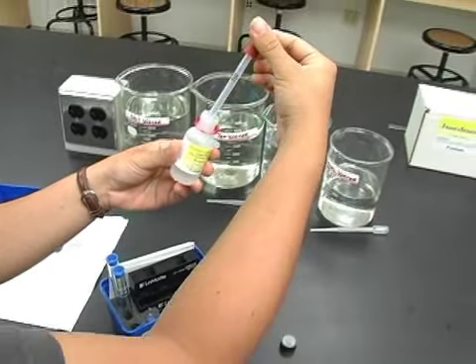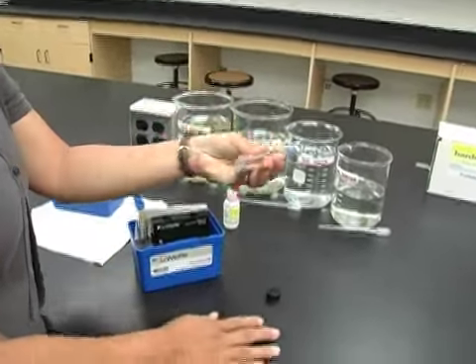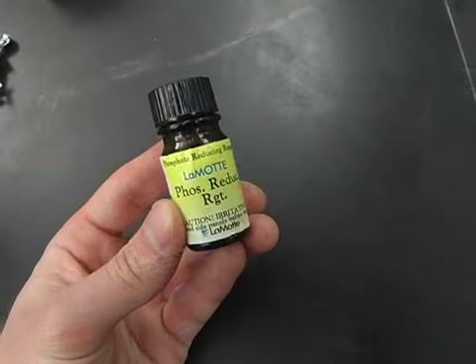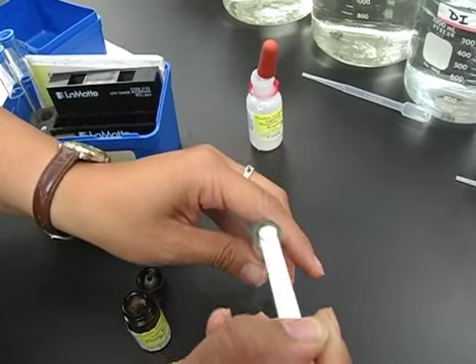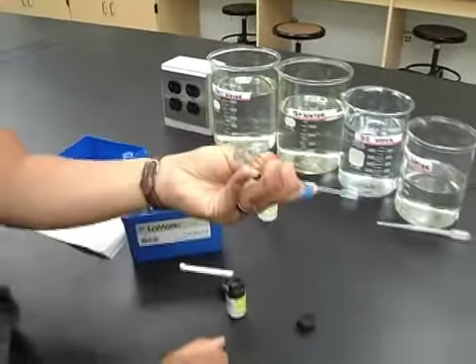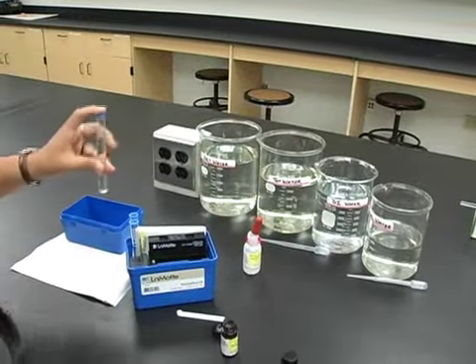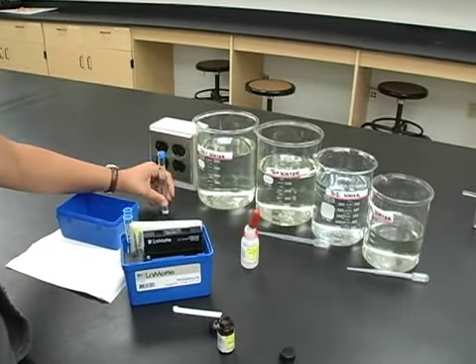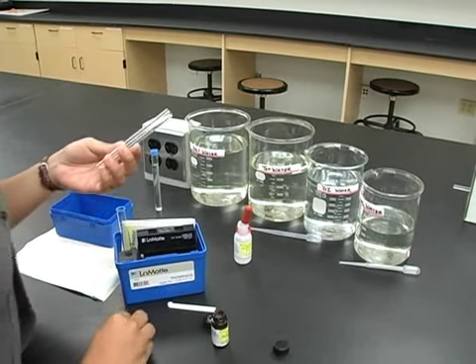Use a pipette to then add 1 milliliter of phosphate acid reagent. Cap and mix well. Then add 0.1 grams of phosphate reducing agent using the provided spoon. Cap and mix until the powder is dissolved. Then place the test tube aside for 5 minutes. Again, while you are waiting, go ahead and repeat these steps for a sample of DI water.